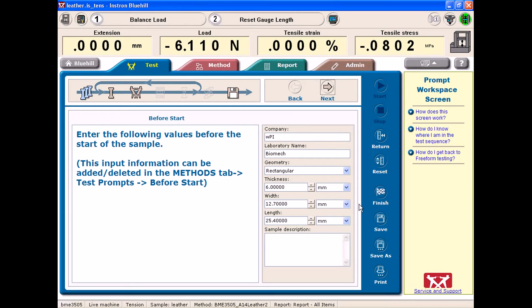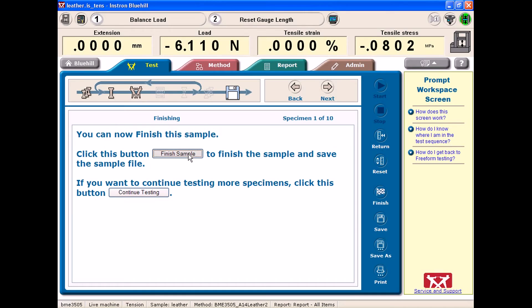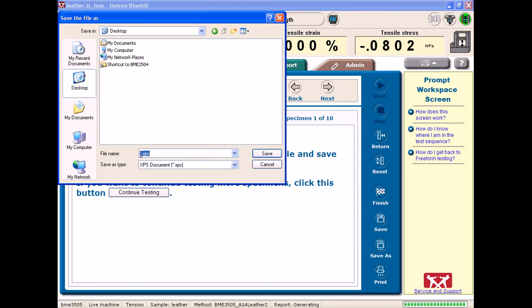Once we've run our test, we want to go to finish, which is signified by the checkered flag. Once you hit finish, and then hit finish sample as well, it will allow you to save your file, which as I suggested I would do to your desktop, and I will file this as example.